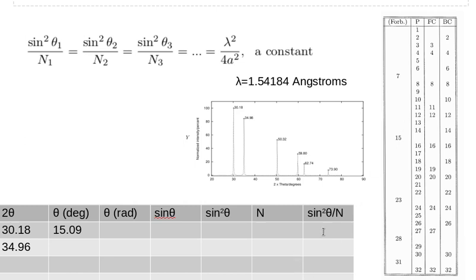So from one of your spectra, from one of your lists of 2 thetas, you must be able to use the n for primitive and get constants, in which case you know it's cesium chloride. And for the other, you should be able to use n's for face-centered and get a constant, in which case you know it's lithium chloride.